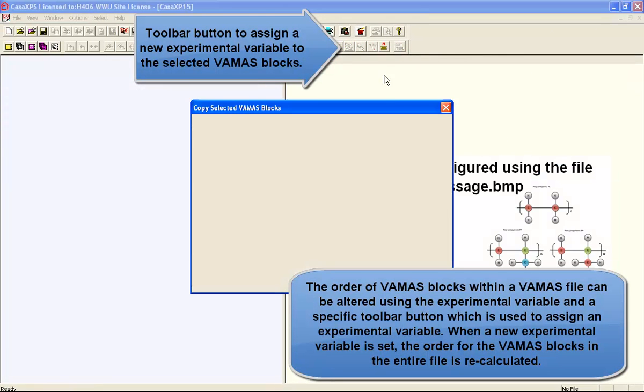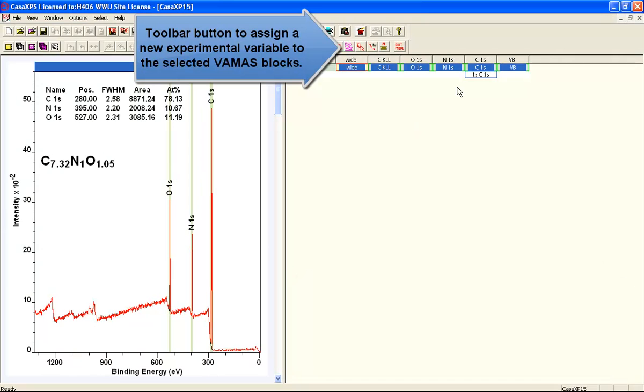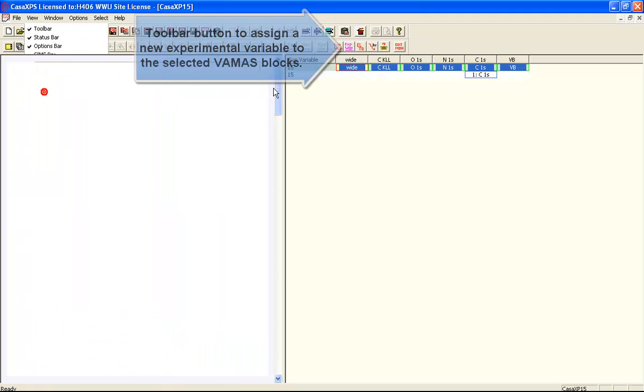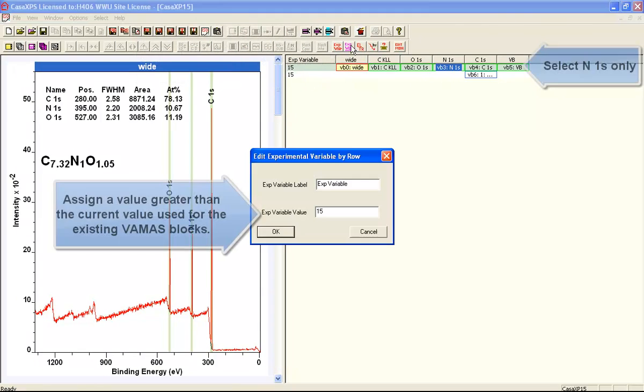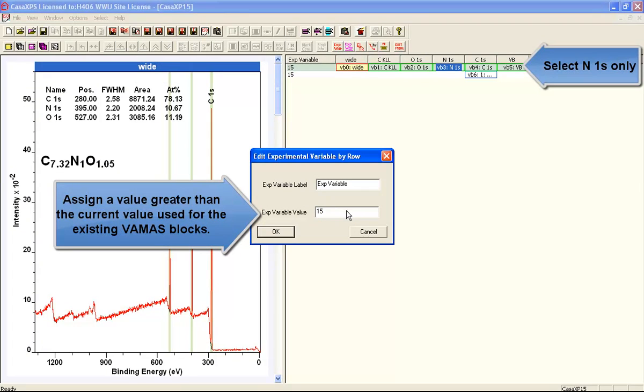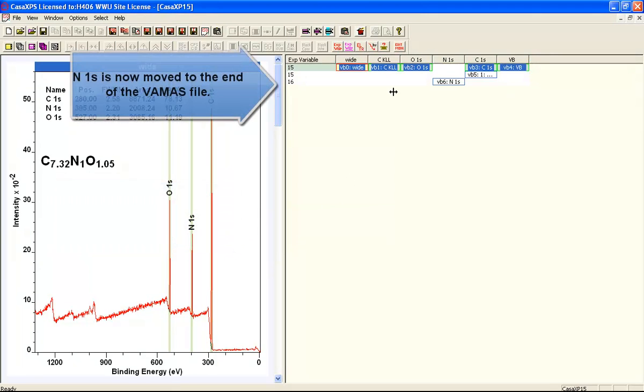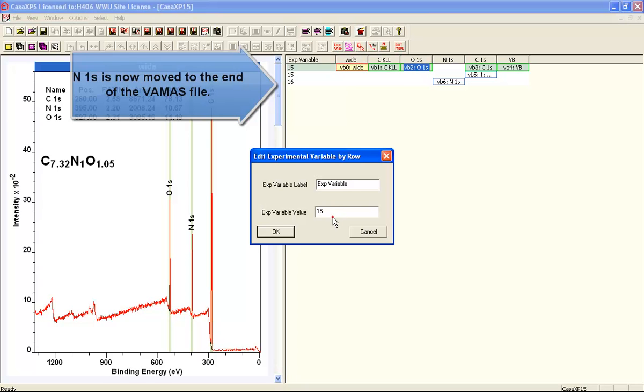The second method for reordering files is using the toolbar button, which is the experimental variable. That lets you assign a new experimental variable. Not only does it let you assign an experimental variable, when you apply this toolbar button on the dialog window, the VAMAS blocks are reordered.